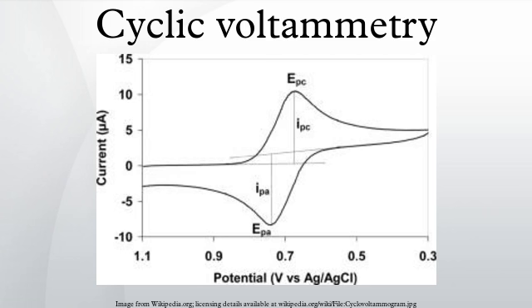Cyclic voltammetry is generally used to study the electrochemical properties of an analyte in solution. Experimental method. In cyclic voltammetry, the electrode potential ramps linearly versus time in cyclical phases. The rate of voltage change over time during each of these phases is known as the experiment's scan rate. The potential is applied between the working electrode and the reference electrode, while the current is measured between the working electrode and the counter electrode. These data are plotted as current versus applied potential.